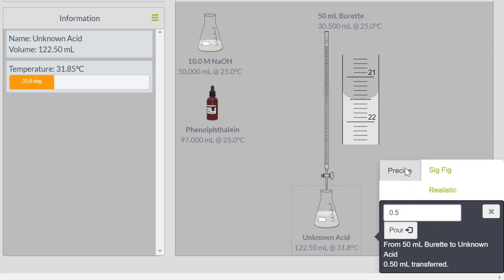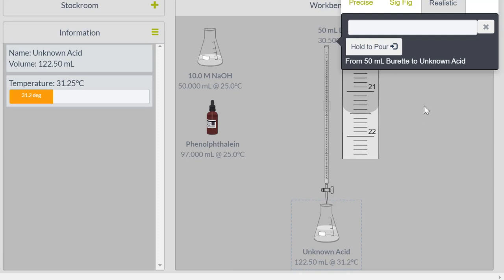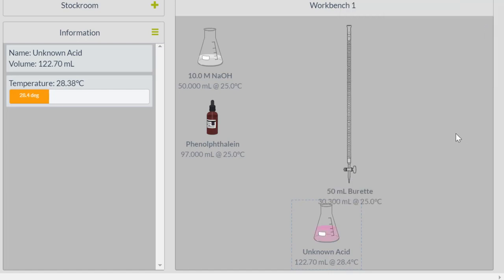Which means now I'm going to go to realistic, which means I'm going to just put in kind of drop by drop. And I'm putting in like 0.05 milliliters each time. And bam! I hit my end point right there.